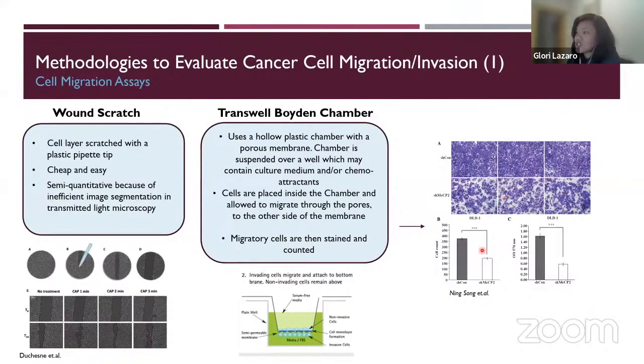And so you can see this is just a cell line that you inhibit a specific protein, and you can quantitate this. And you can see here, this is the control at the top, and at the bottom you inhibit this protein called MECP2. And you can actually see, it's obvious that maraming cells sa control, and then here if you inhibit this protein, konti na lang. So konti na lang nagmamigrate from here to here because we inhibited this protein.